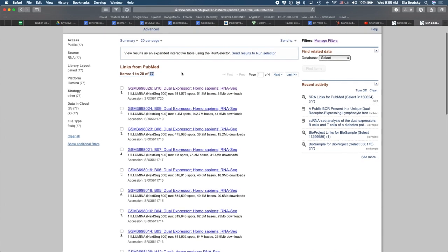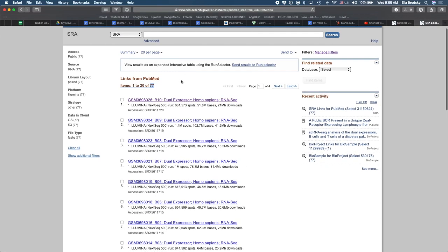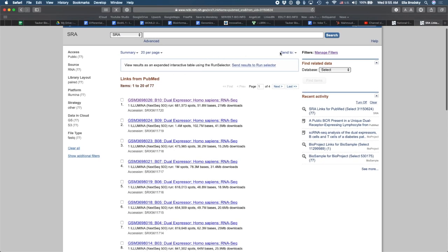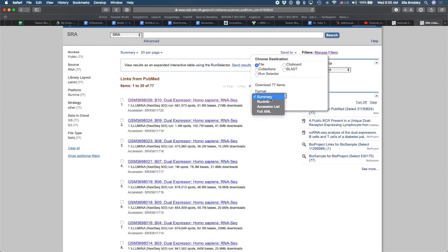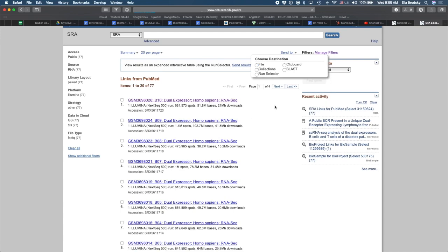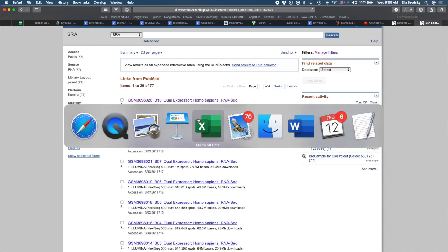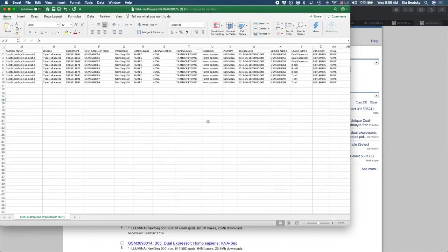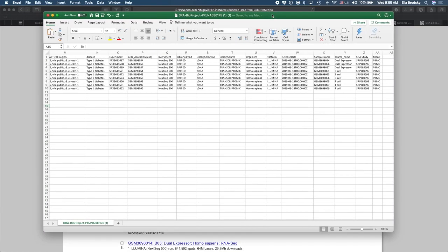And how do we find the actual data? What we can do is we can go right here to Send To, click on File, and here in Format, we can select Run Info and Create File. So it's going to download a file. You can see that the file downloaded. And I can look at this file. Now I'm not going to take all of the 77 files. What I would rather do is take a subset of those files. So here, I've selected nine files.